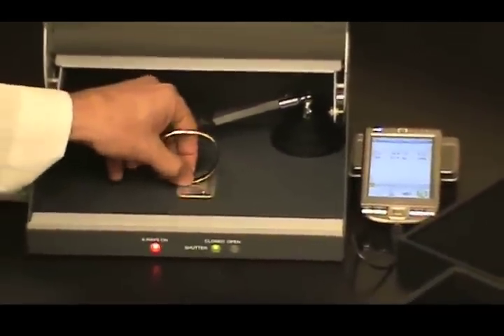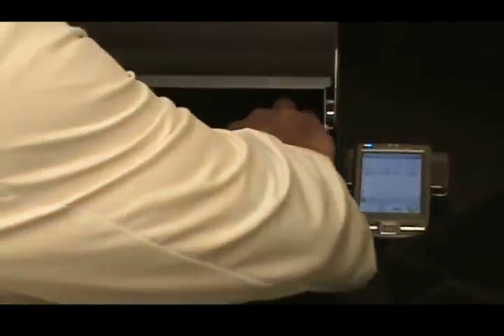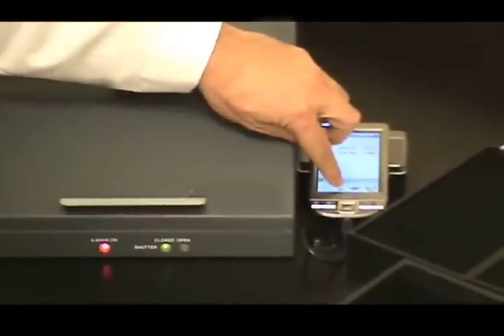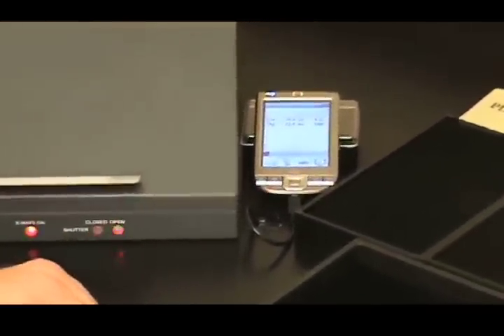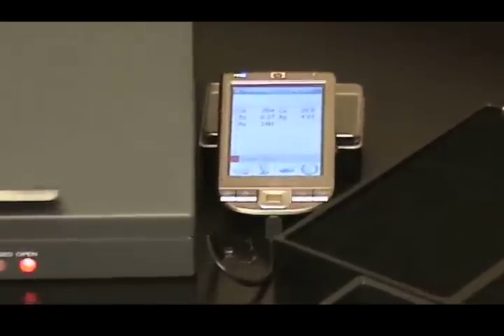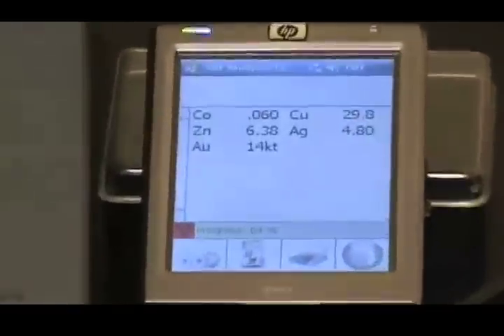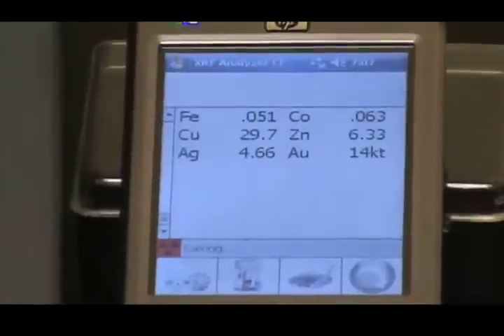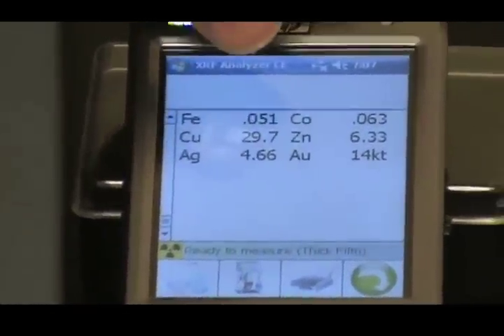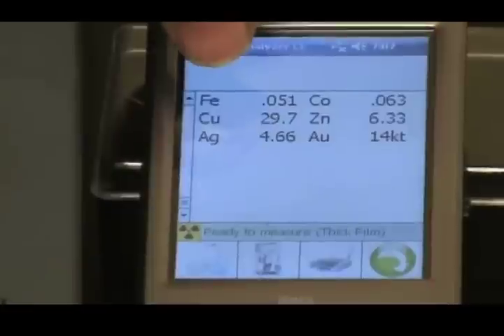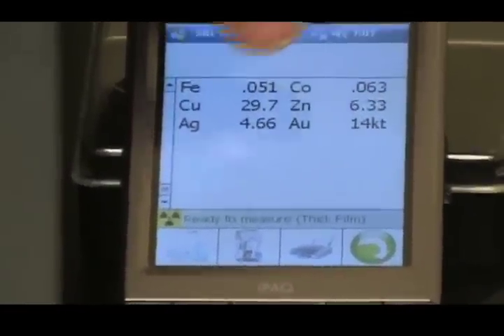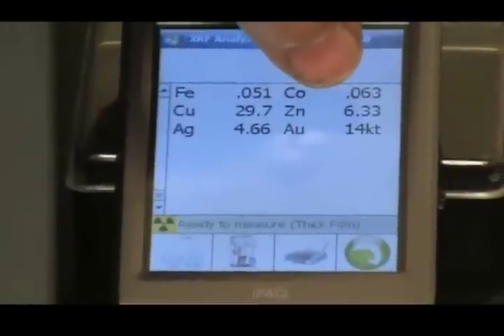Now I'm going to test the bangle. So very interesting. Fe is iron, just a touch of iron. We have copper, cobalt, zinc, silver, and this item is testing out at 14 carat.